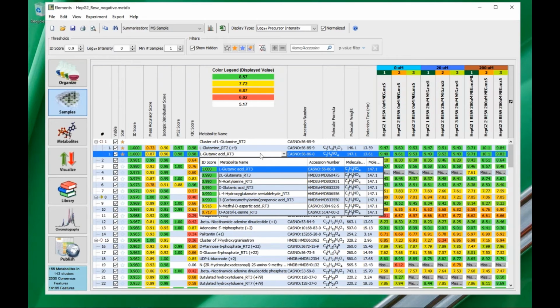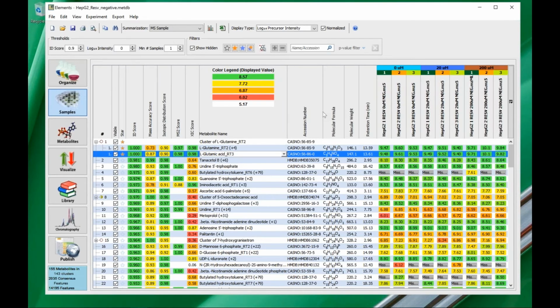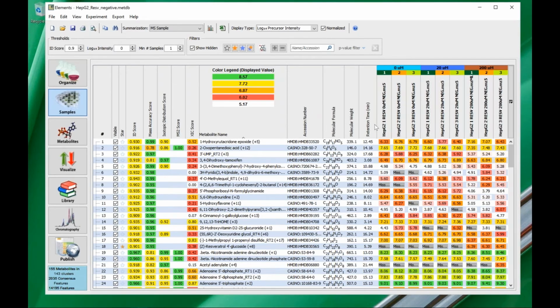Thus, you can't differentiate among them. There's no difference in evidence. But some features obviously score better than others, because the features assigned to those are slightly better. They just hit it a little bit better. So more than likely, it's these top few, but the others had the same evidence, so you couldn't quite differentiate between them.